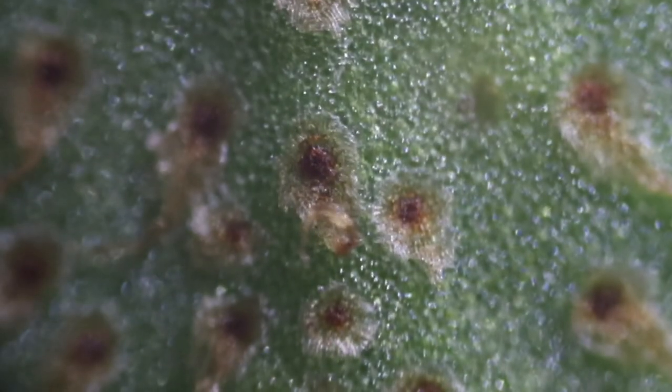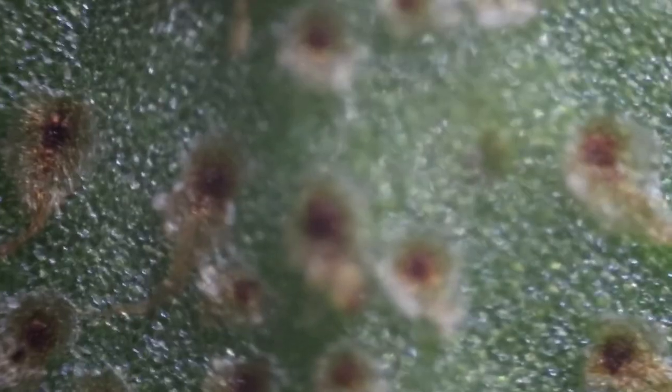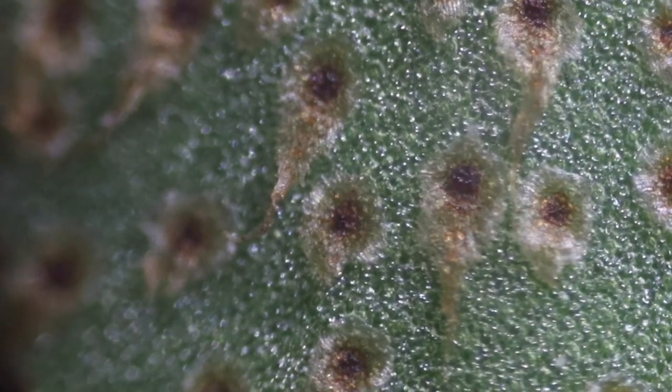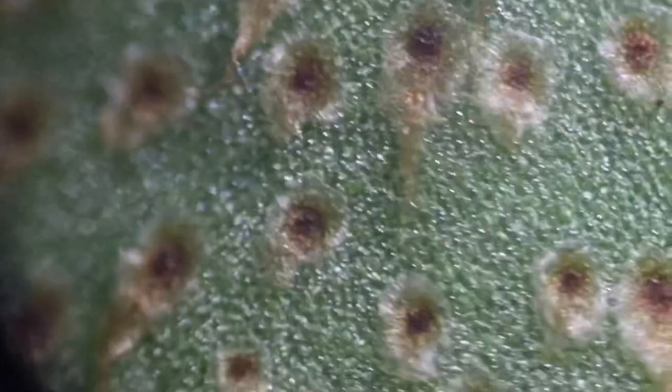This piece is part of a fern that has spores on the bottom, and what you're seeing there are the spores. Let's increase the magnification a little bit on this one and see if we can get one of those spores focused a little bit. I'm going to try to get it in the center. Actually moved it out of the lens. And then we'll need to bring it back into focus. How interesting is that.